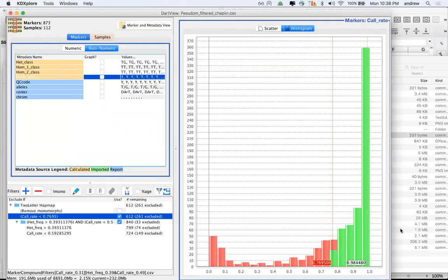Are there any other questions? Hi, Andrew, can you hear me? Yep. I understand this filtering is a very nice feature within a data set. If you have large populations from DArT, mixing many different populations, is there a way of also looking at them by individual populations? So in terms of if you had additional metadata.